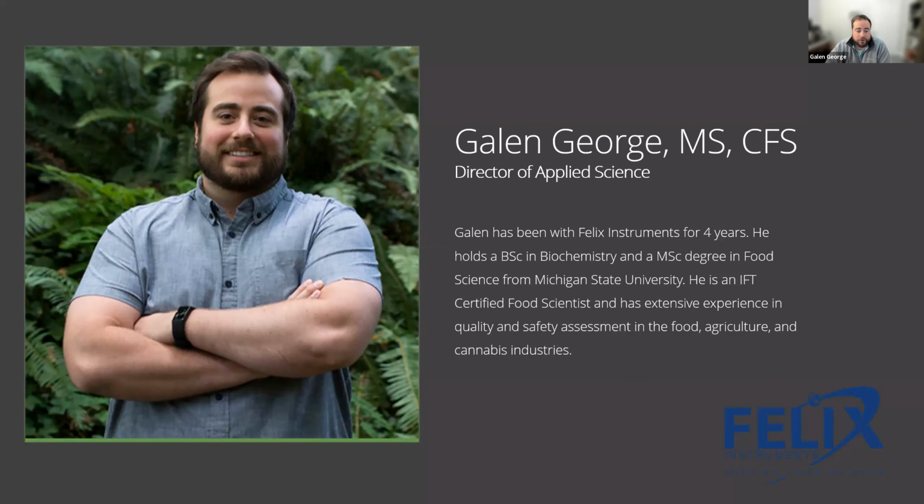So without further ado, let's jump into a little bit of a review. What we've talked about thus far, and it's been a little while, in the model building process is sampling and collecting the spectra and performing the analytical testing necessary to build the data sets to then build a model with. So we're at the stage now where we need to start using our multivariate data analysis, our chemometrics, to take this data and build it into a predictive model or a discriminant model, depending on what the application is. And that's what we're going to be discussing today.